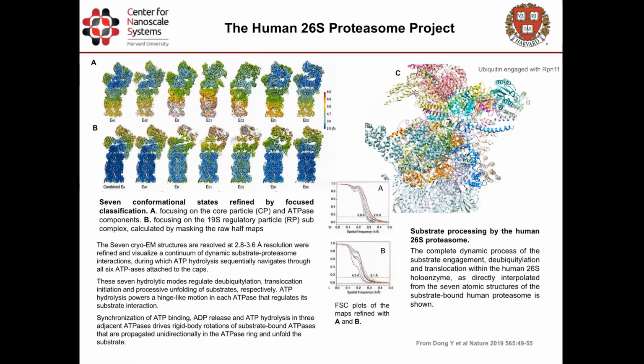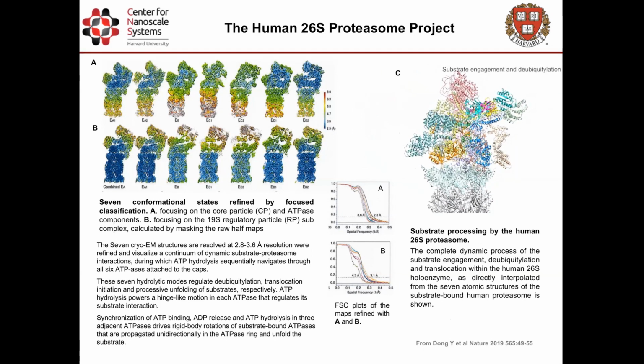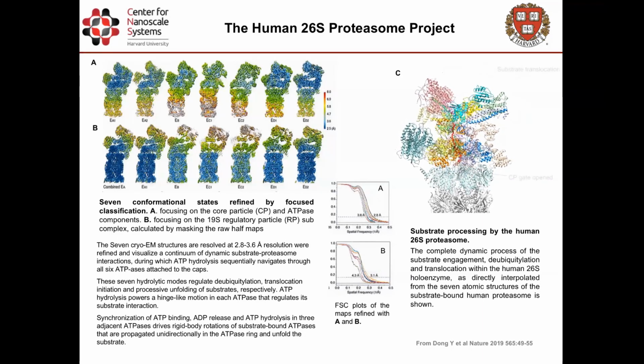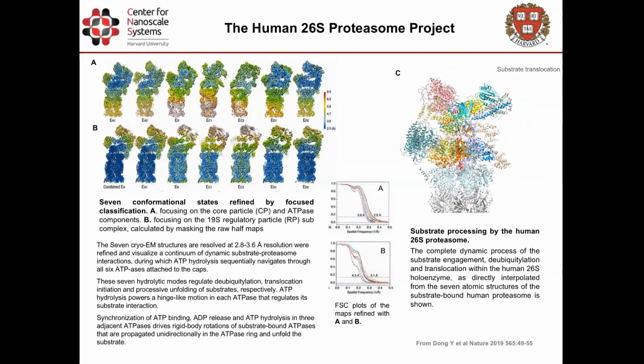You can, of course, see the paper. There are more movies and much more explanation, but this is a tremendously difficult work, and it took over 2-3 years to achieve. It was a stepwise process, and data were combined from many Cryo-EM sessions. The first one I was not present for, just the one which we carried out in 2017 and 2018. But a full Cryo-EM high resolution project will culminate in a structure like that.